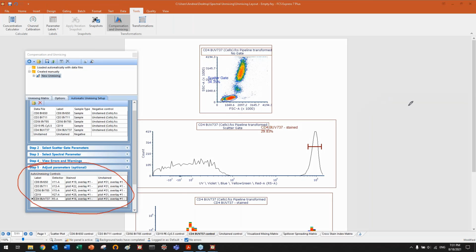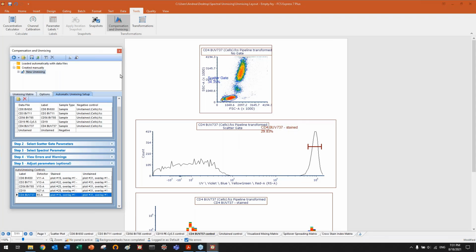Okay, two ways to do the same stuff. What you see here, step 5, is because not all instruments give access to the raw detector directly. Before closing these, let me go to the last 3 pages that we have here. FCS Express automatically creates those 3 pages.